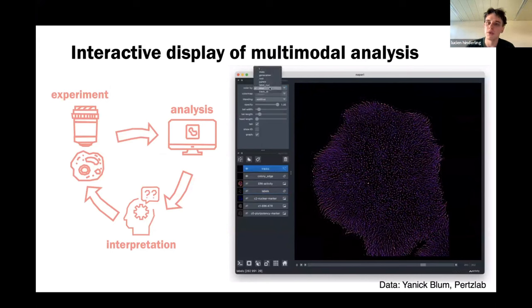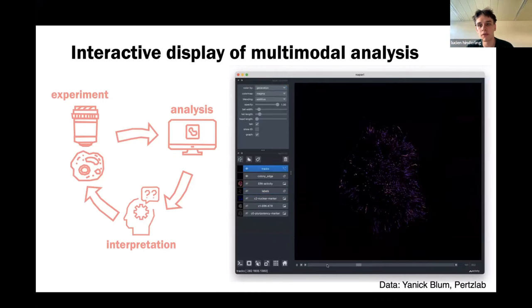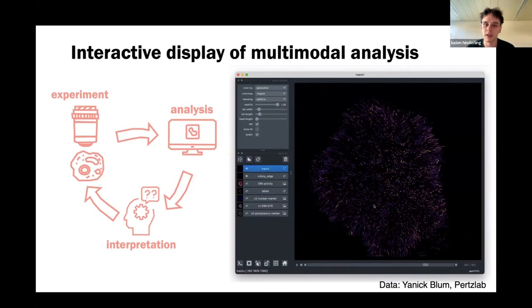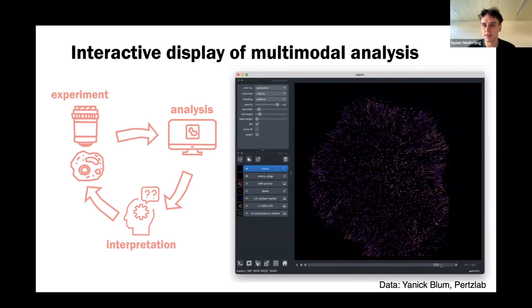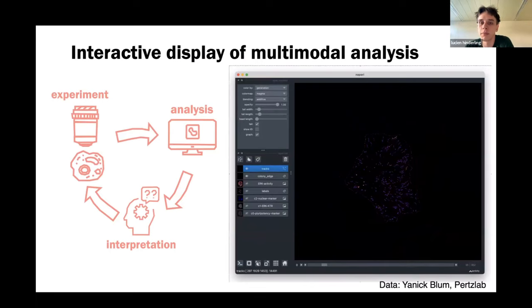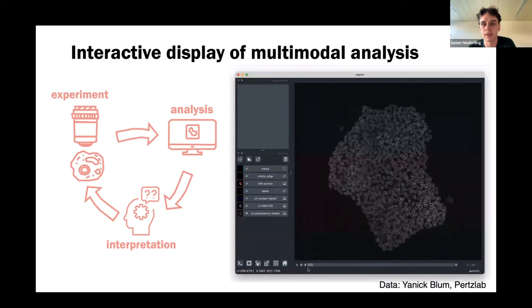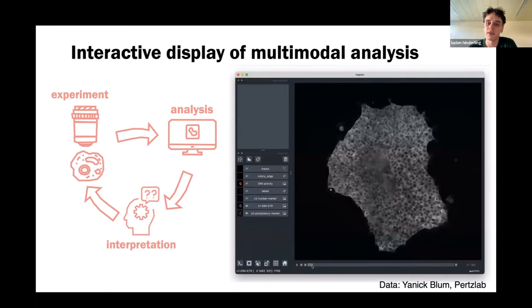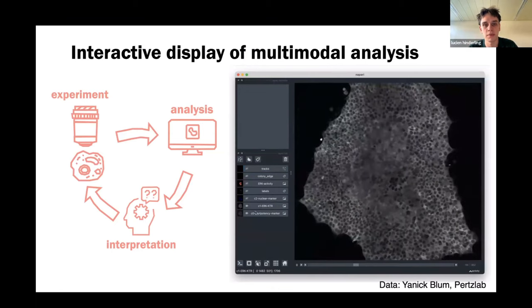In this movie, you can see analysis of a stem cell colony with very multimodal analysis — we have tracks, segmentation, and biosensor quantification. Napari is amazing for this because we have all these different layers we can combine. It's not just images but also other kinds of data, and it's very interactive, making it great for quality-controlling processing steps.